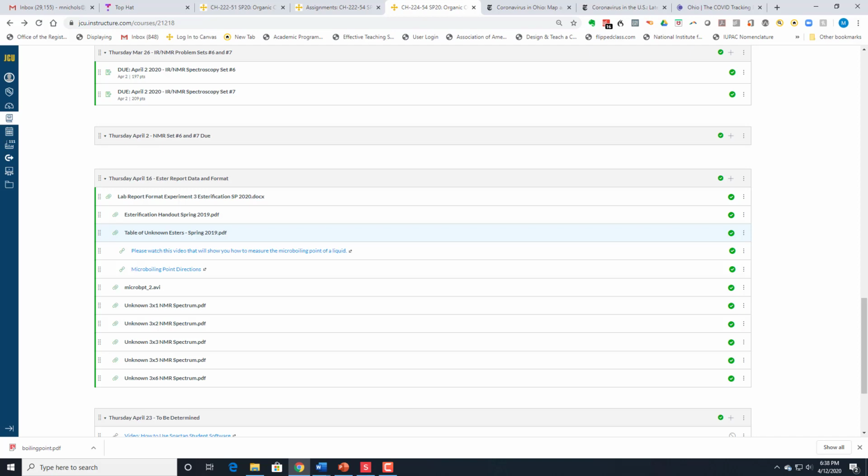And then there'll be a link for this video, which isn't there right now because I'm recording this video. And then there's a video on how to measure the microboiling point, which we'll go over. There is a handout, which I'll show you the key parts of, and then the actual video of measuring the microboiling point. And then down below are going to be the NMR spectra for each of the unknown numbers, and we'll go over what 3x1 and 3x2 means in a moment. So that's what we're going to take a look at here.